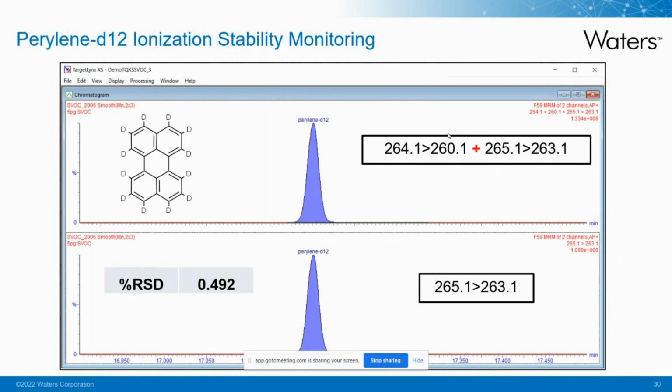And this about 0.5% RSD, again, over 30 to 36 hours of analysis, showed that the chemical composition of that gas flow and the breakdown between the division of ionization between those two forms stayed relatively even and constant. If you can make out that basically the ratio of ionization was fairly even, and that is controllable to an extent by the cone gas setting.